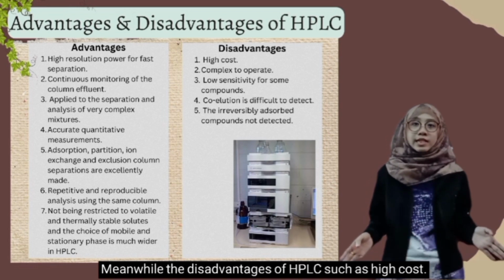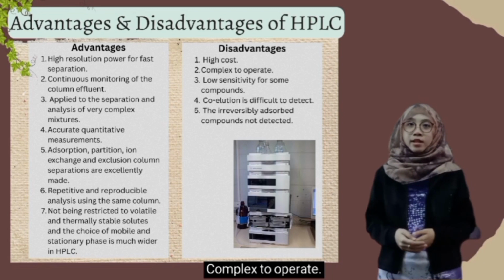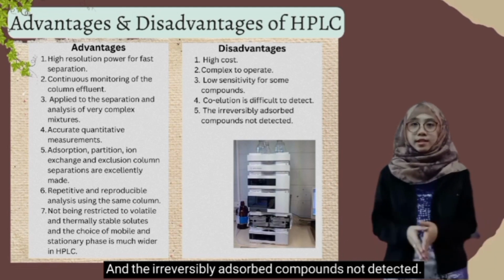Meanwhile, the disadvantages of HPLC are high costs, complexity to operate, low sensitivity for some compounds, coelution that is difficult to detect, and irreversibly adsorbed compounds not being detected.